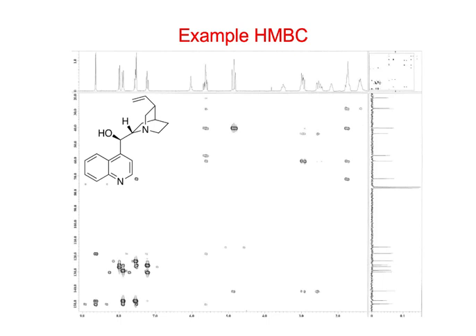Okay, so this is the HMBC, heteronuclear multiple bond correlation. This is the experiment that we would usually use for multiple bond correlations, because it's the proton detected one. This experiment shows a few artifacts, though, that bleed through.